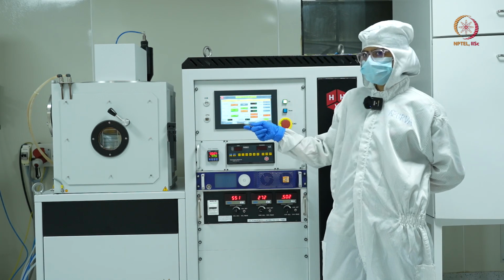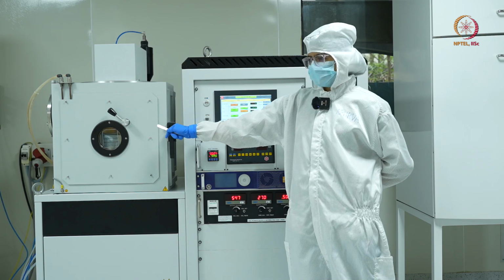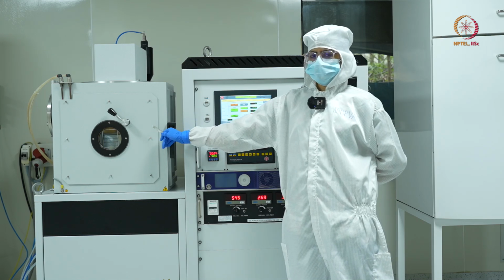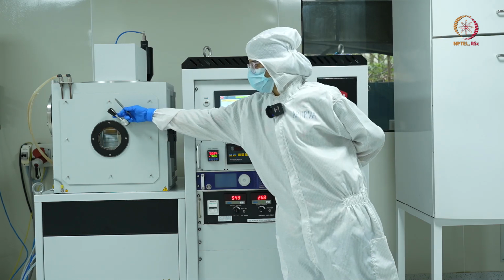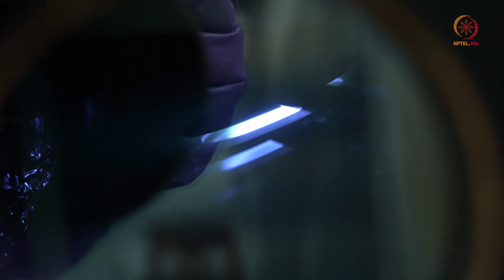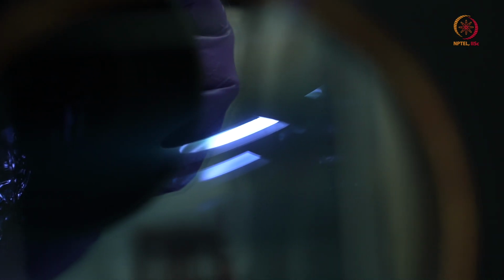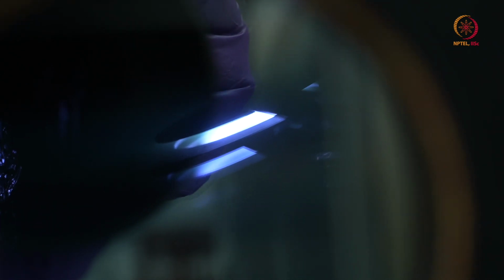Now we'll have a closer look at the viewport, and if the plasma is there, you will be able to see a glow discharge when I open this viewport. So as you can see, a light bluish color plasma has struck. That means the argon atoms are getting ionized and bombarded onto the target.